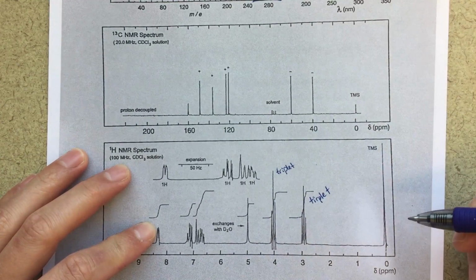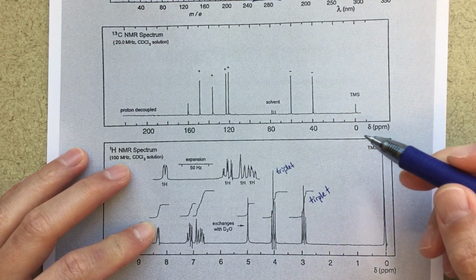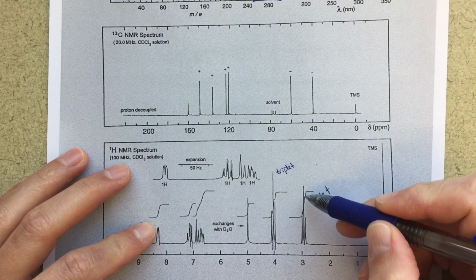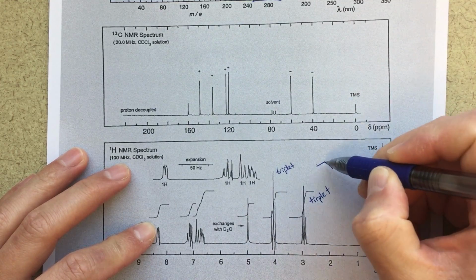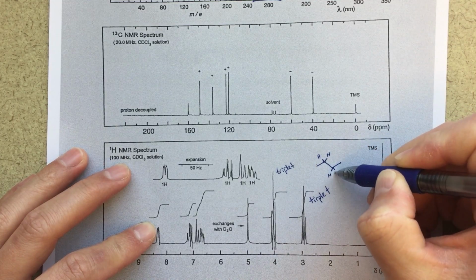I'm not sure why I spelled triplet as "terplet" right there, but that means triplet as well. Got a little dyslexic with my I and my R there. But I've got two high triplets. So these look like they're both too high as compared to my OH peak. So this to me is very clearly two CH2 groups right next to each other.